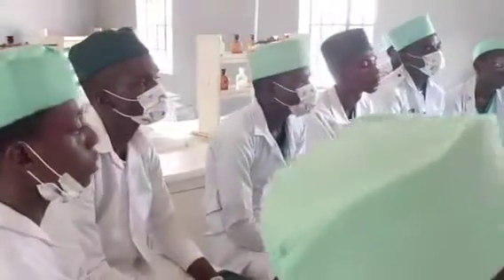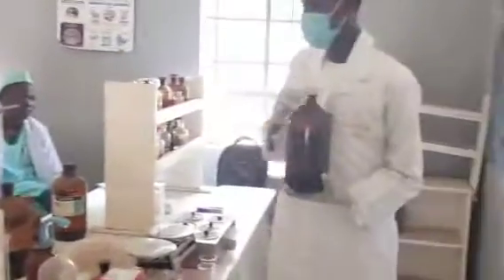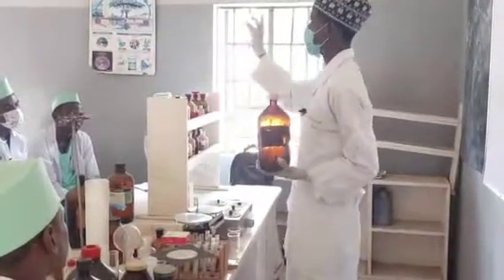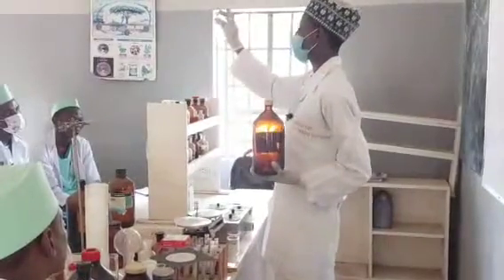For example, this is our hydrochloric acid. Let's say you want to use only 50 mils, and you try and you got like 150 mils.